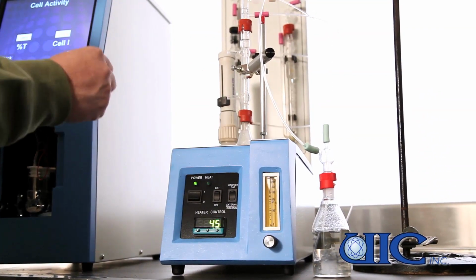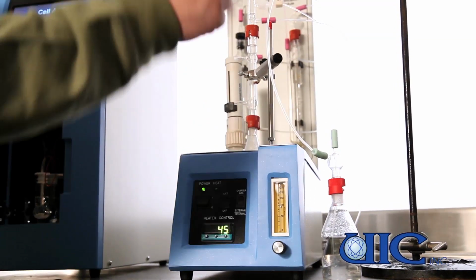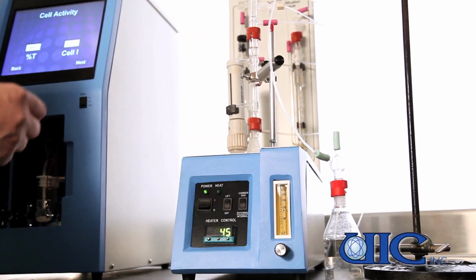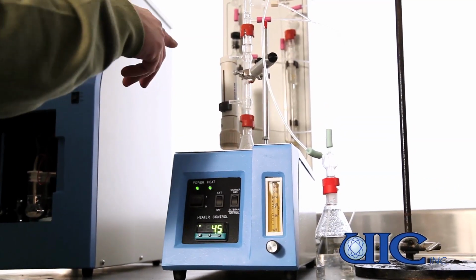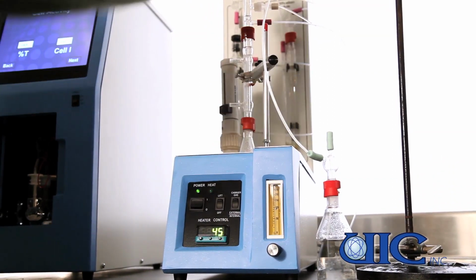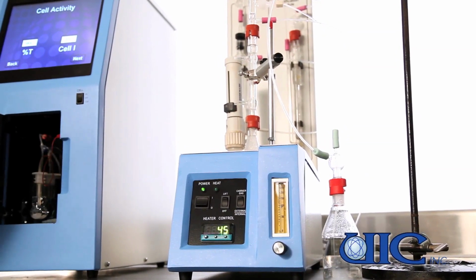So when we react with our sample, the CO2 and most likely H2S will come off, bubble through the scrubber solution, where we'll see a black precipitate form. That means it's working and removing the hydrogen sulfide. The gas then goes out of the auxiliary scrubber into the indicating scrubber, and then out and into the back of the coulometer where the carrier gas enters the cell.